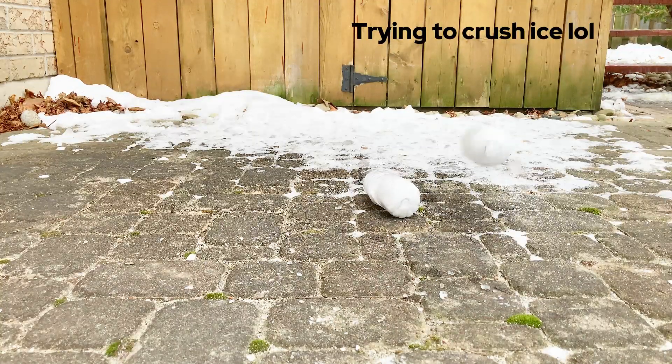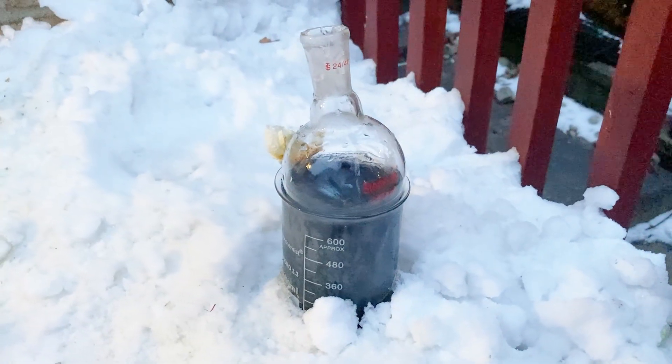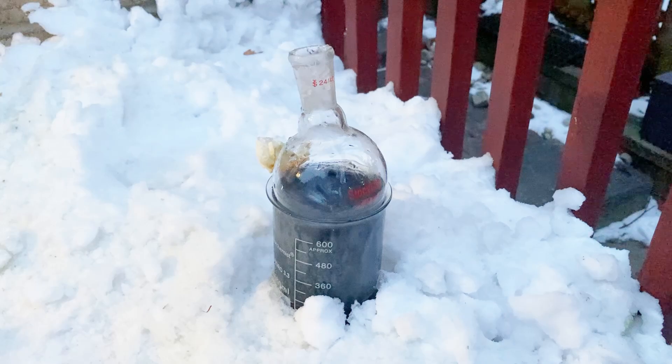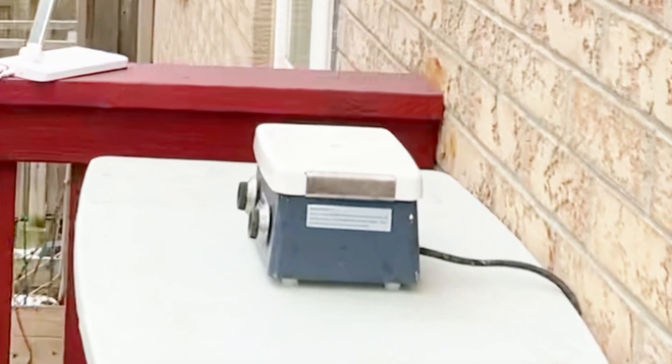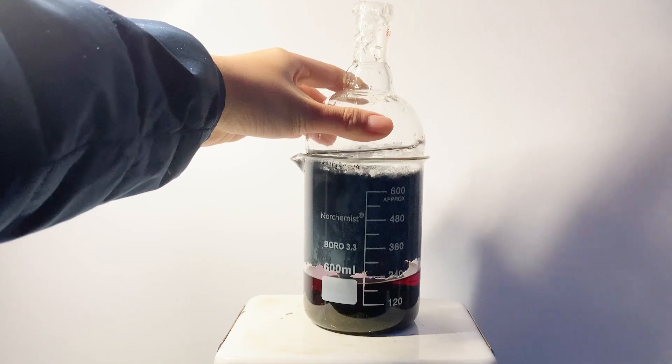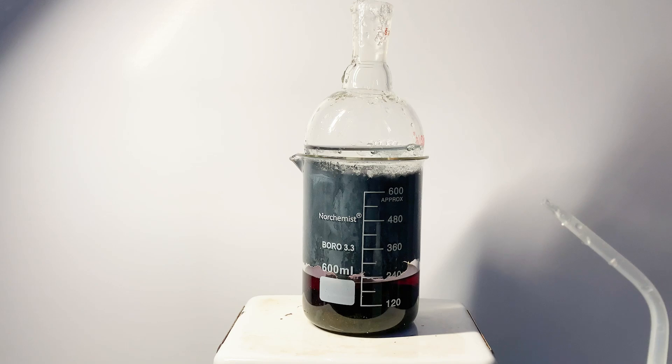To do this reaction, I'll need to do it outside as I don't have a fume hood, and I won't want any dense purple fumes indoors. Now this is one downside — I'm in Canada, and the winter here is crazy cold, at sub-zero temperatures, and my hot plate stirrer even froze solid to the table. That's why I'm constantly rubbing my hands, and my squirt bottle doesn't even work because it froze as well, five minutes after coming outside.